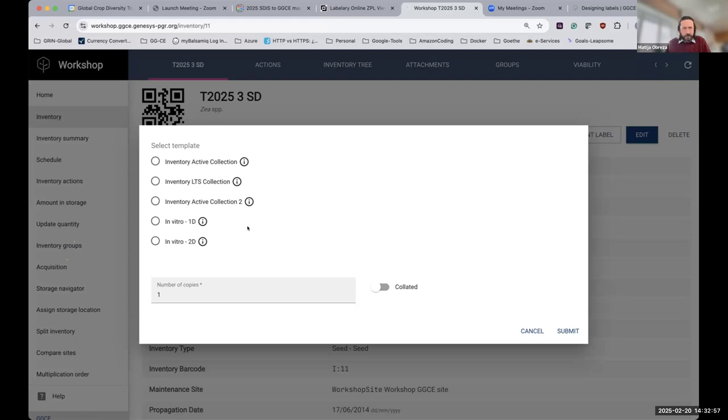That's a bit unusual. I've not experienced that, but I guess it happens. So in your case, I guess you'd have to do the filtering by crop and then print separately. Then again, printing should happen when you need the labels. It shouldn't be like I have 10,000 inventories of sorghum and print 10,000 labels. That does not really help because the risk of error is too big.